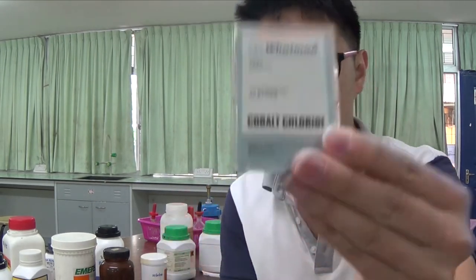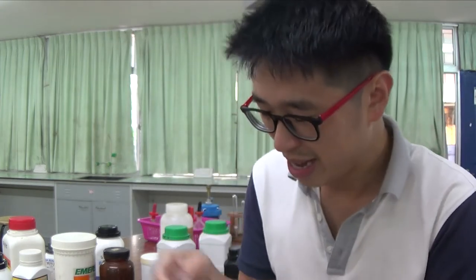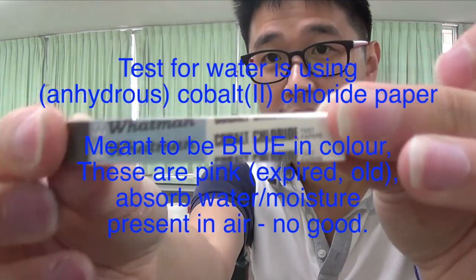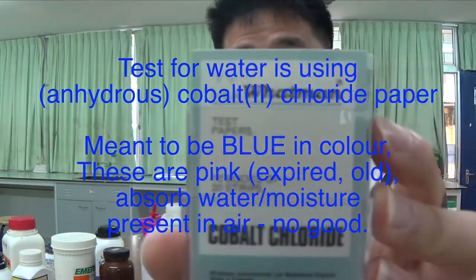The test is using cobalt chloride. So not surprisingly, this is cobalt(II) chloride. This is a strip of paper. It is pink in color. Okay, it is pink in color and it says cobalt chloride. I get it from this company.